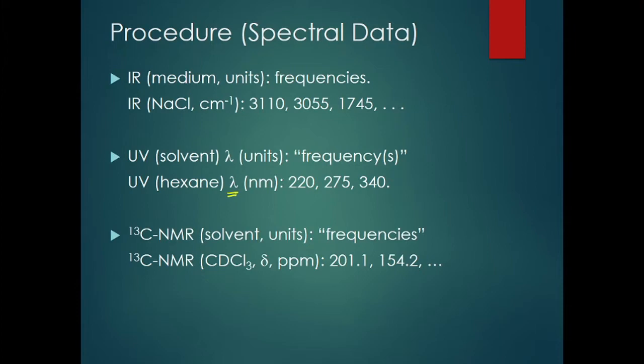And units are nanometers, and again you simply list the individual frequencies. Do note that regardless of how broad a peak is, you give a single value at the lambda max for that peak.